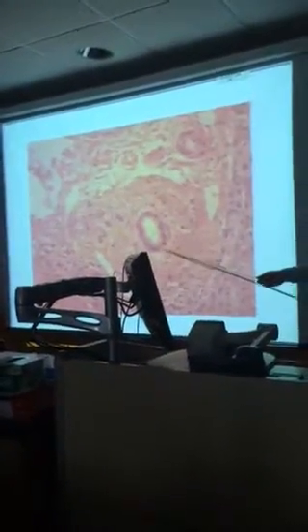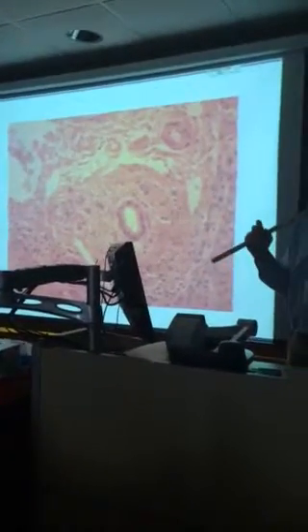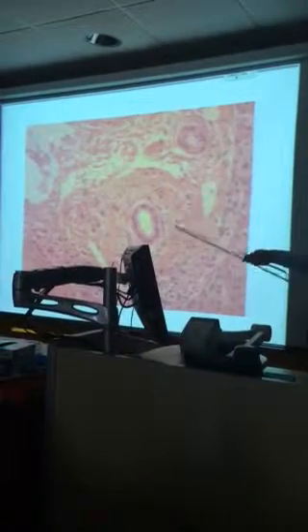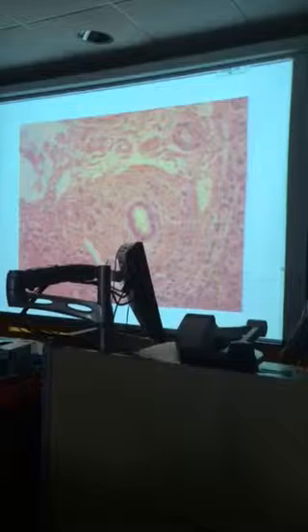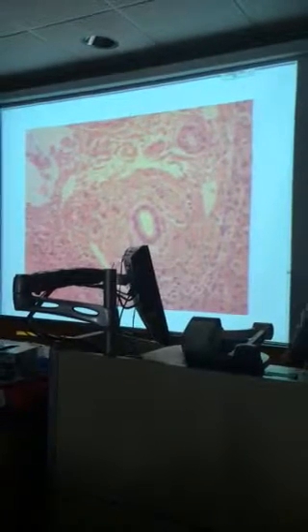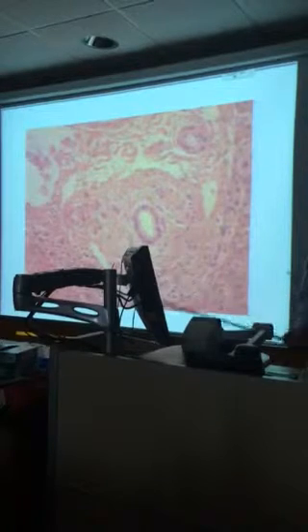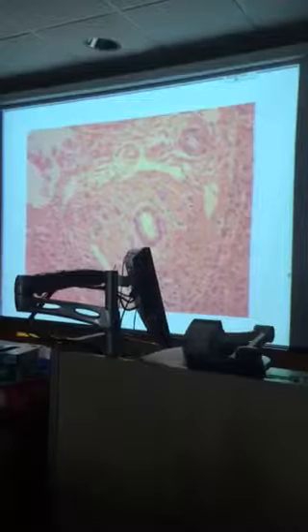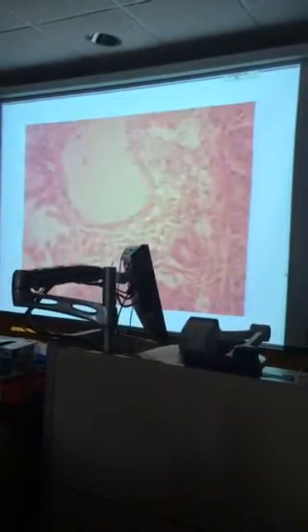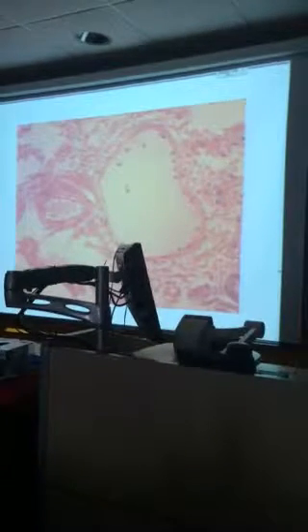That's a bile duct. One of the things the liver does is produce bile. It's secreted into little canals called bile canaliculi, which drain into these bile ducts at the edge of the lobules in what's called a portal triad. Then they collect in larger bile ducts and eventually go to the common bile duct and are carried into the small intestine. All right, so here's the portal triad. Bile duct, carrying bile produced by the liver, and then two blood vessels, which are quite different. Both are bringing blood in those capillaries, but different kinds of blood.